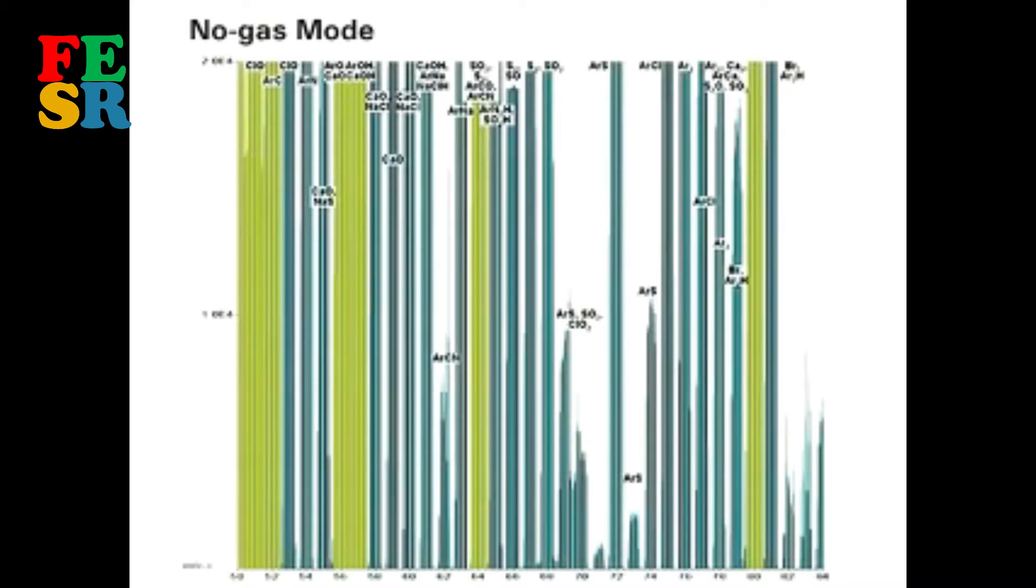This spectrum was acquired in normal mode, that is, with no gas added to the cell. Almost every analyte in this mass range suffers severe polyatomic overlaps, making quantification impossible at trace levels.